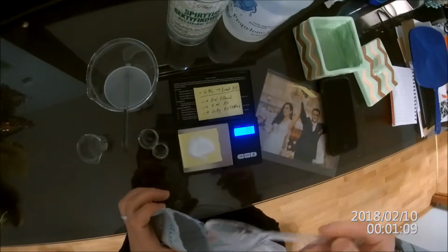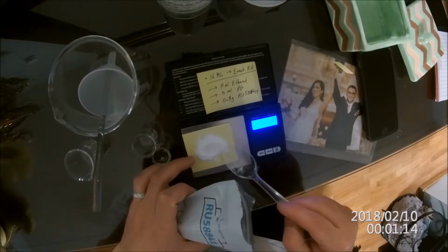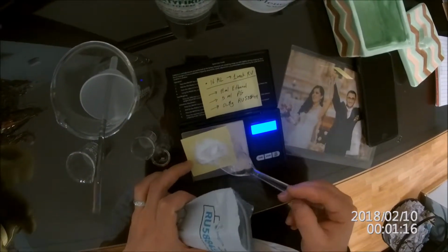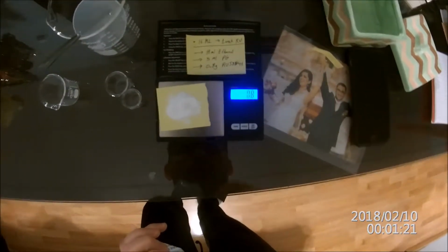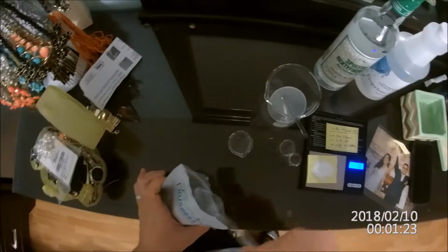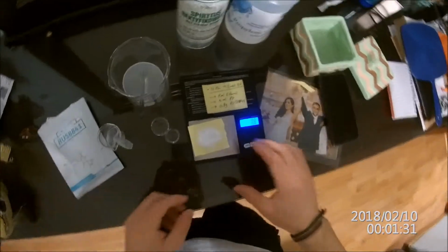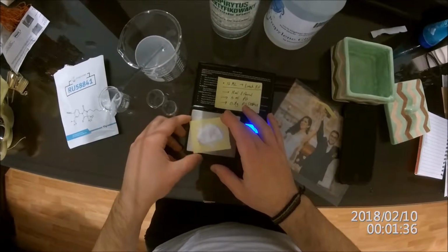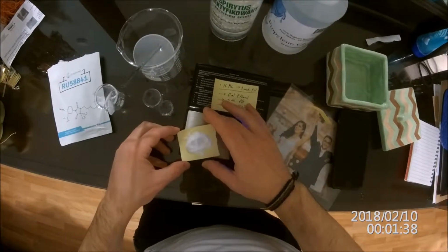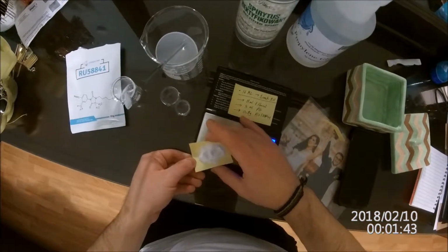And I'm sure there are more accurate and precise utensils that you can use rather than this stupid plastic spoon. But anyway, we're here. 0.8 grams. Cool. I'll leave this here. So what I'm going to do is take the 0.8 grams of RU carefully. Don't want to spill it. Carefully. Make sure the paper doesn't pop on you.